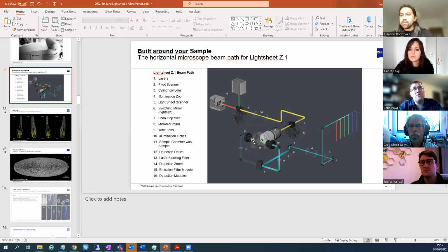If you have a really, really thick sample, then you might want to take the first millimeter, and then you might want to adjust the sheet and take the next millimeter. But yeah, most of the time you just adjust the 2 sides.